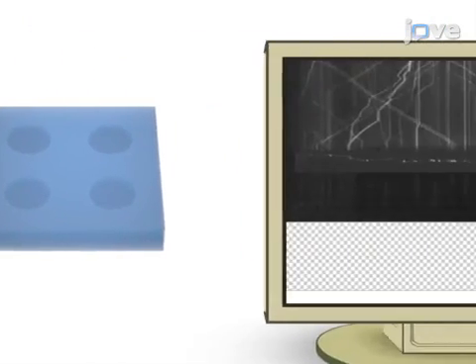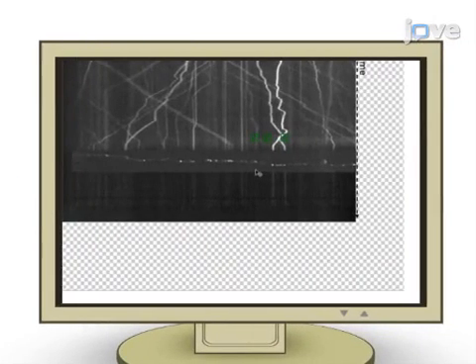Next, the fixed cargo and motor images are aligned to the plots of cargo movement over time, also called kymographs, in order to correlate the live cargo movement with the stained associated motors as determined by the immunofluorescence staining.